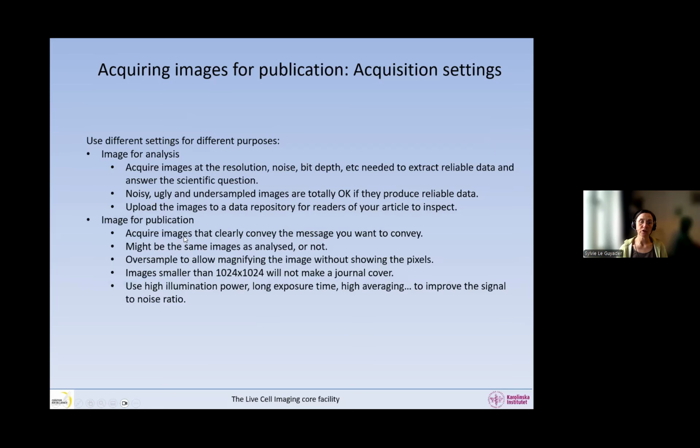If you acquire an image for publication, in the sense that it's going to go into the paper or on the cover, the goal is completely different. The goal is now to acquire images that clearly convey the message you want to convey.